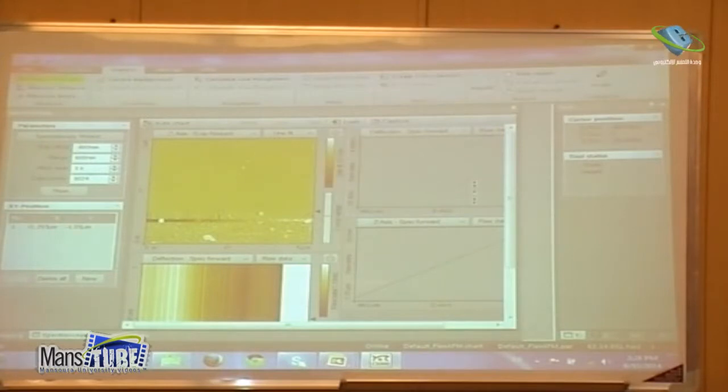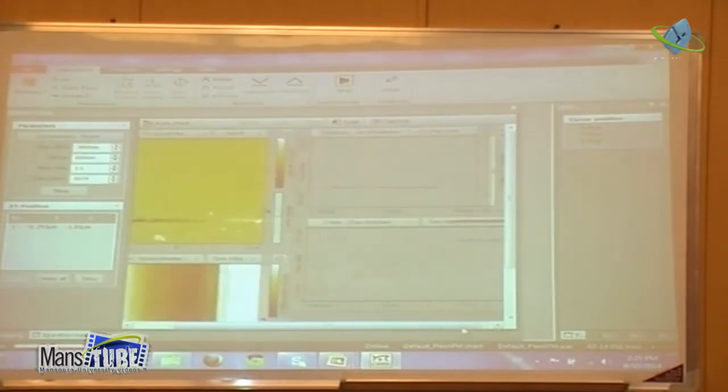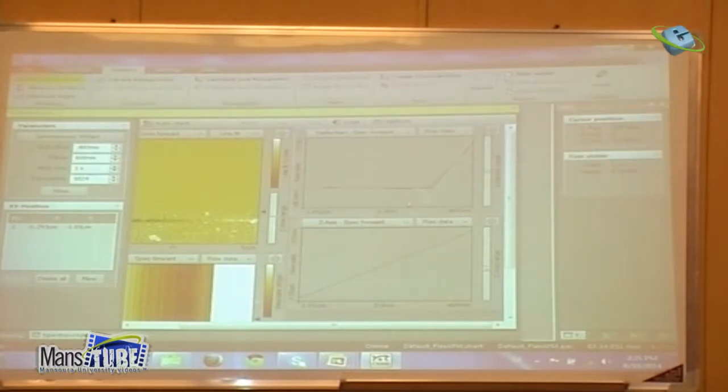So what I do, maybe I can restart the same spectroscopy, and then you can see. Okay, so now if I want to measure this from here to here, if I go to analysis, measure length, then from here to here is about 8 nanonewton. Now, because I know the spring constant, I determine the exact value, and you can see that this value is really the exact value of the adhesion force. This is, for example, 1.